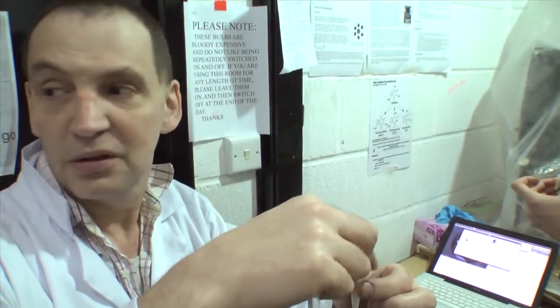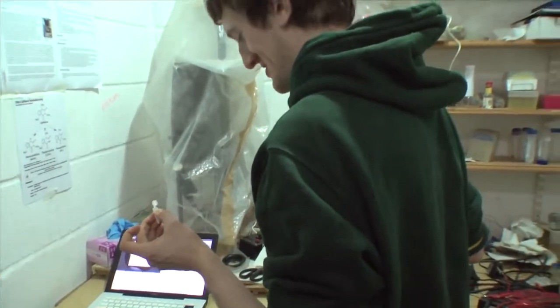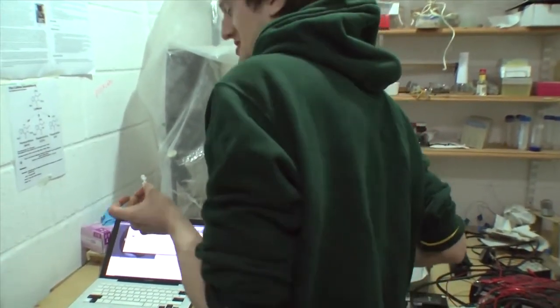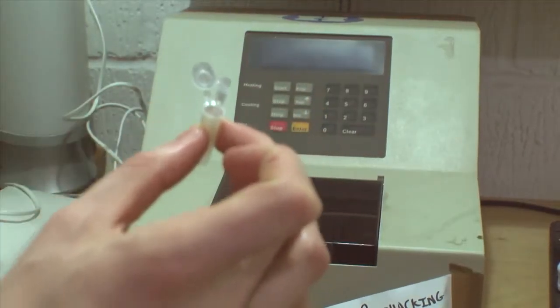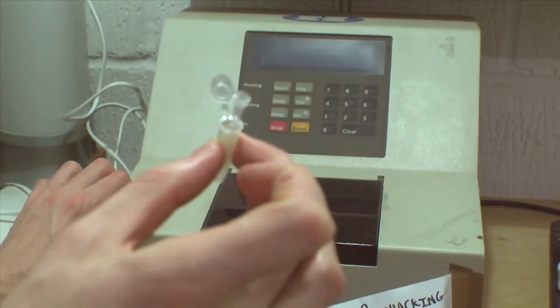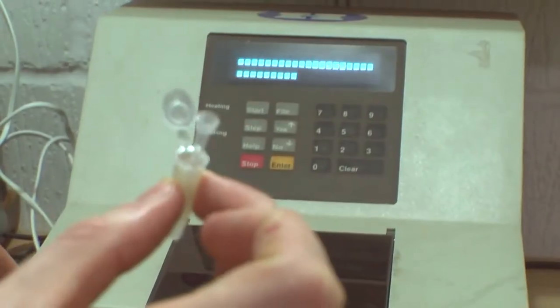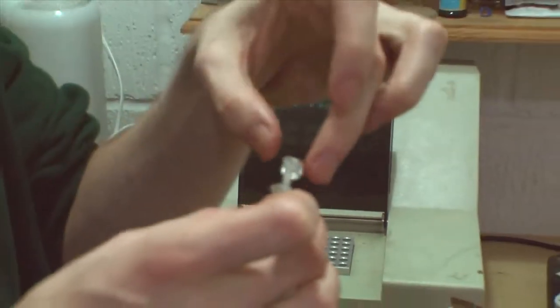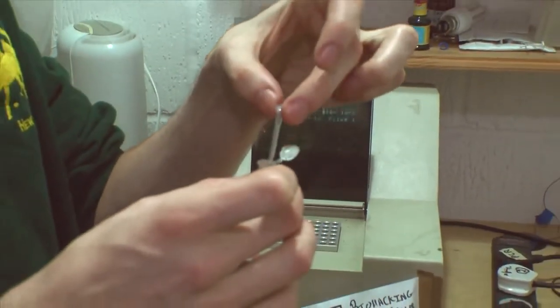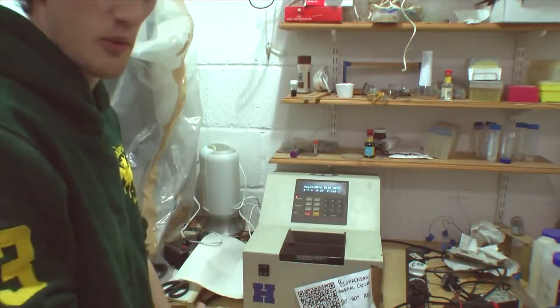What's that noise? That's the thermal cycler again — that's the most hacker-looking thing in the place. We're using our thermal cycler, which is just going to keep it at 100 degrees. If someone didn't have one of these, you can just put it in boiling water, which has exactly the same effect. So we do this for 10 minutes.